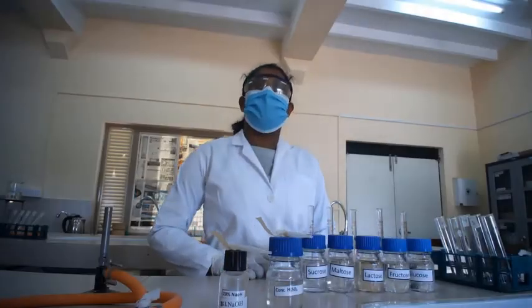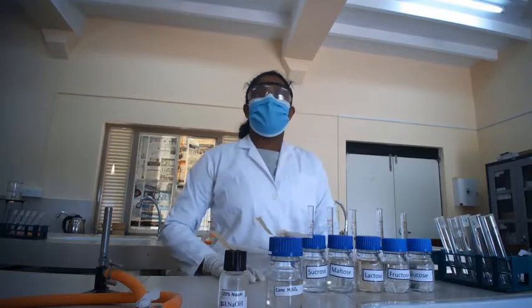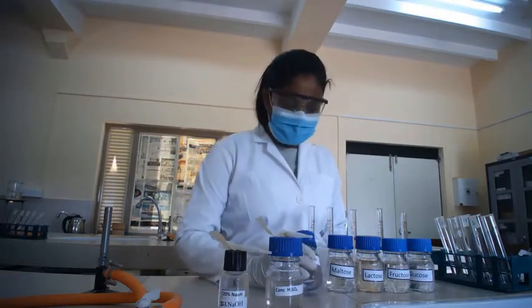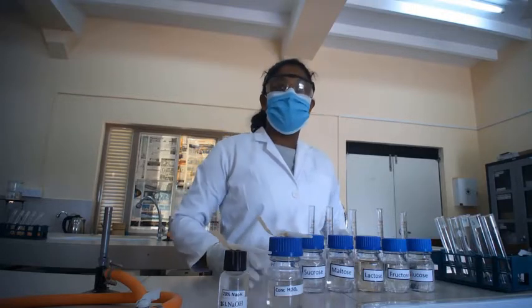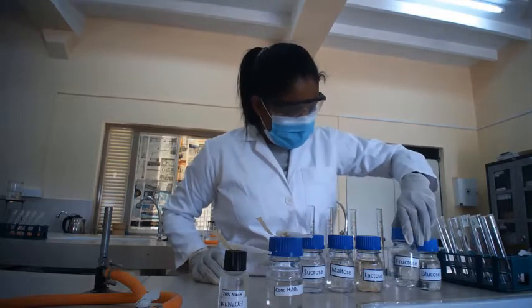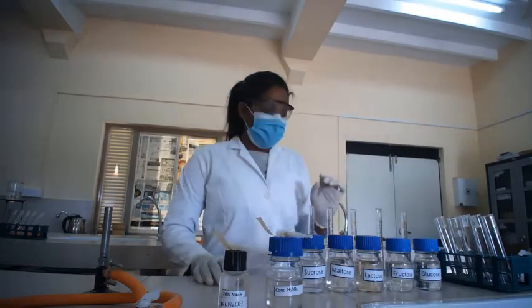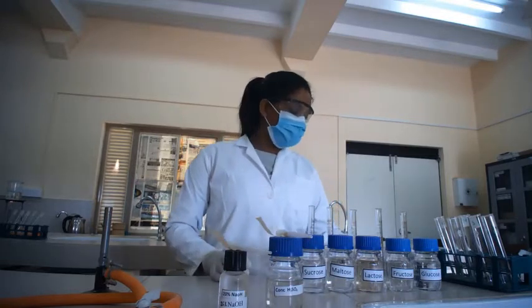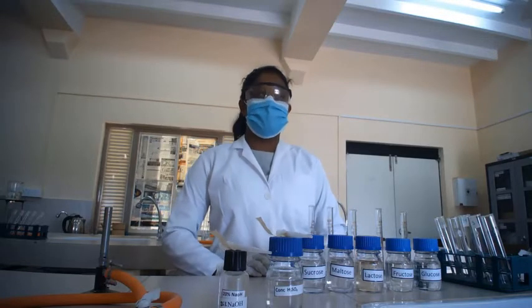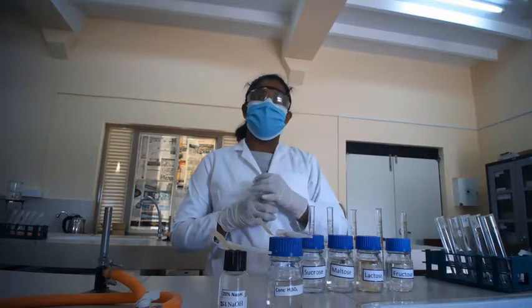Today your first practical is Moore's test. We are going to do this practical for the carbohydrates. Here you can see we have selected 5 carbohydrate solutions. First one is glucose, fructose, lactose, maltose and sucrose. First of all, you have to get 10 milliliters of each solution for the test tube. Before that, you have to take these solutions into a beaker.